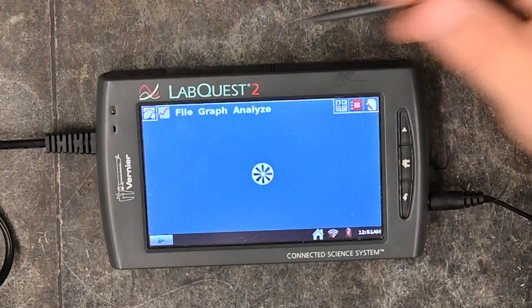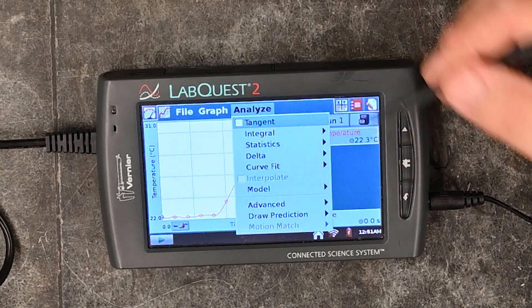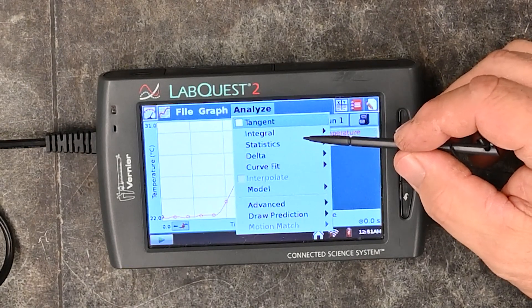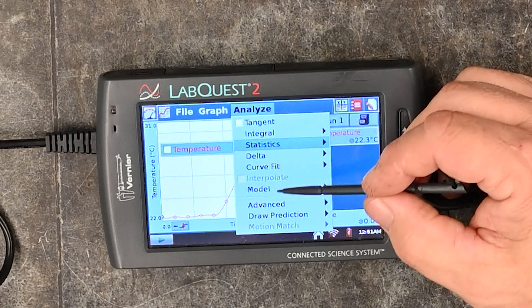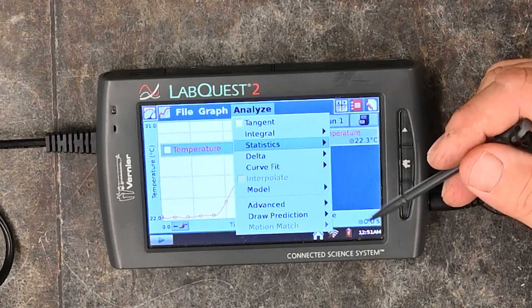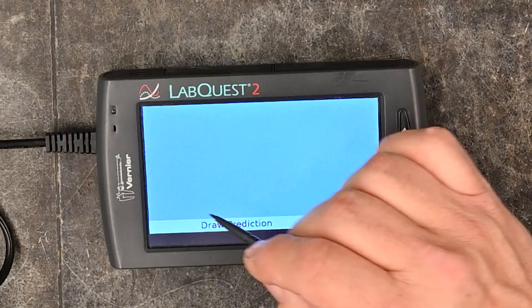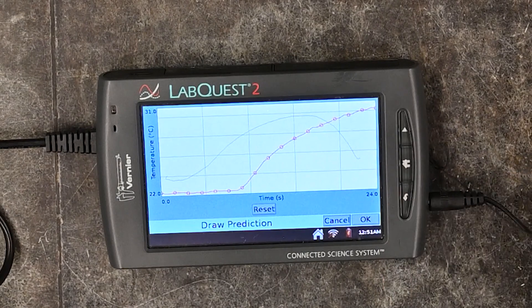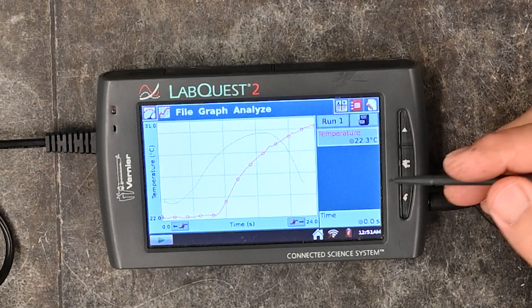Going back to the graph, you can do some analyzing. There are all kinds of different ways to analyze: you can look at statistics of the graph, do a curve fit, and more, depending on the lab. You can also draw a prediction — hit draw prediction, draw what you think is going to happen, click OK, and that prediction will be visible when students run the experiment.